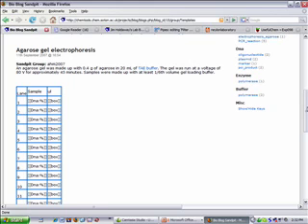So up here, the system will look for anything that's been labelled as DNA. The percentage symbol is a wildcard, so it's looking for any post for which the metadata DNA is not empty, because those are the type of things you want to run in a gel. The box, unsurprisingly, creates a little box that you can type into.